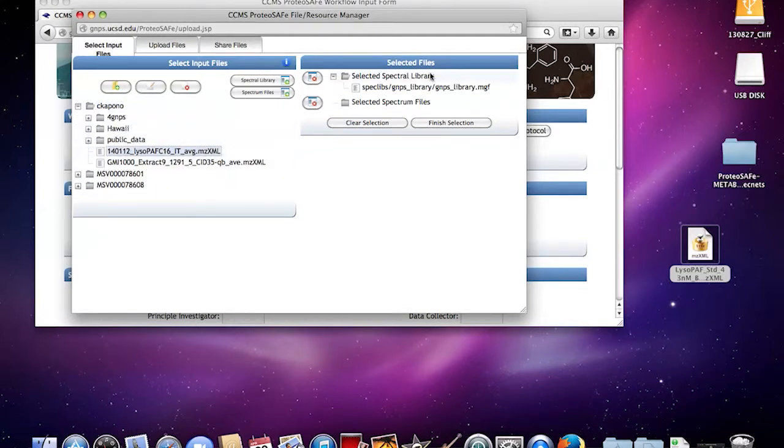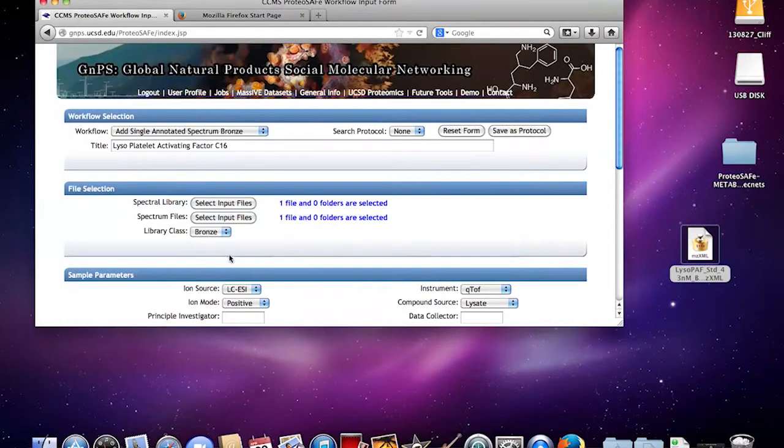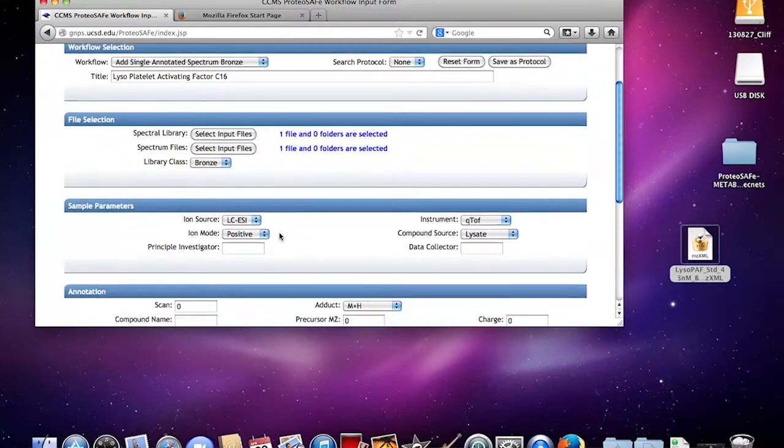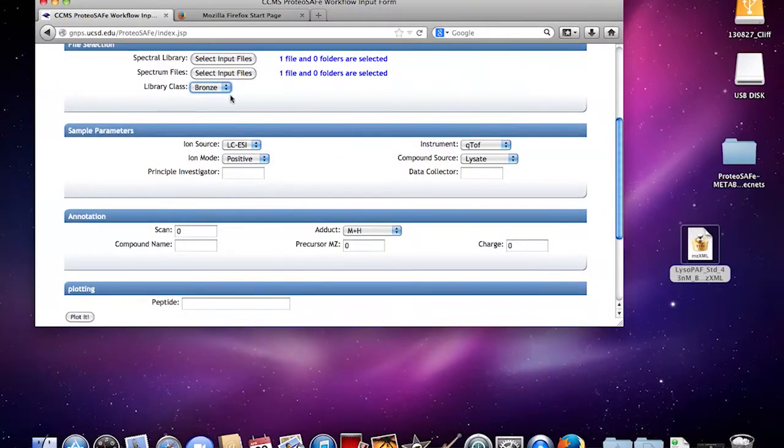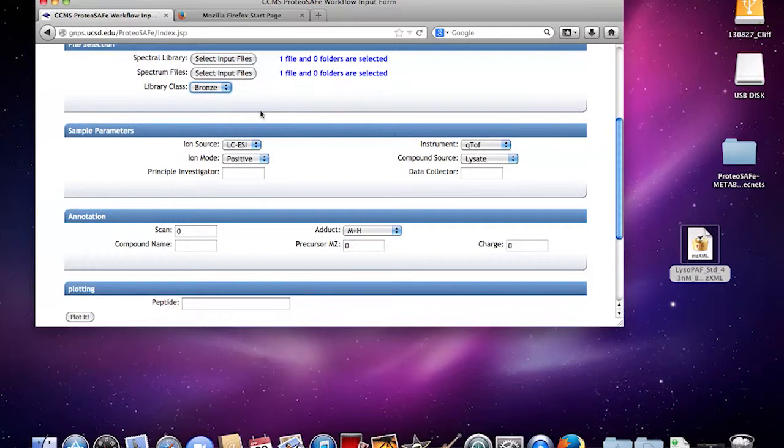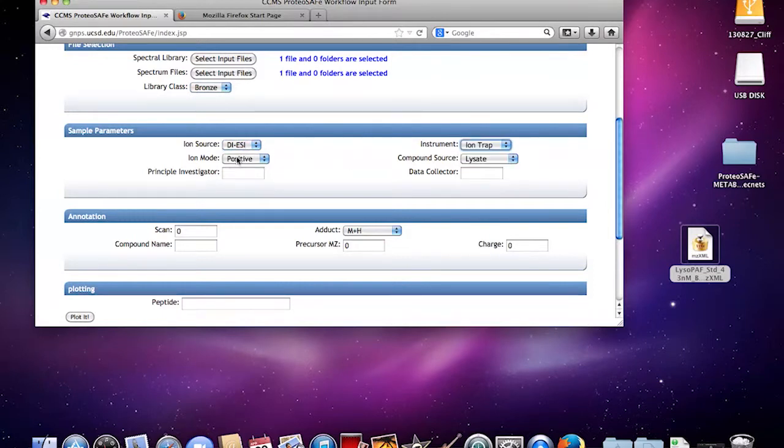This is the library you're going to be uploading to the GNPS library, and this is the file that you're going to have in your spectrum file. Finish selection. Library class would be bronze—there's silver, gold, depending on the confidence of data upload. We're going to do a direct infusion from iron source instrument, from an ion trap, positive mode from commercial.